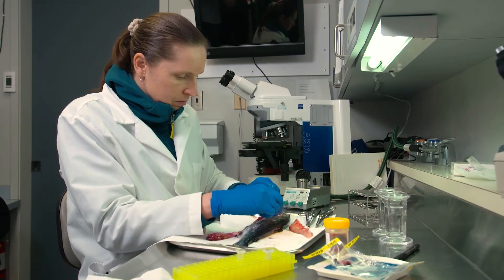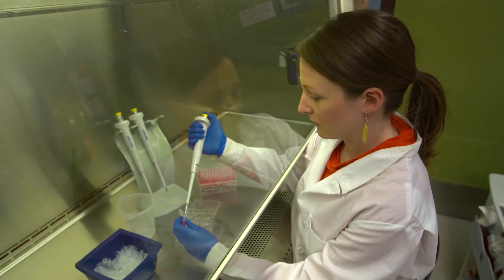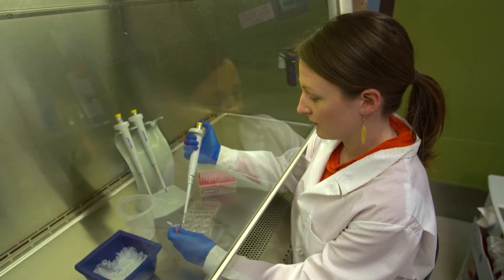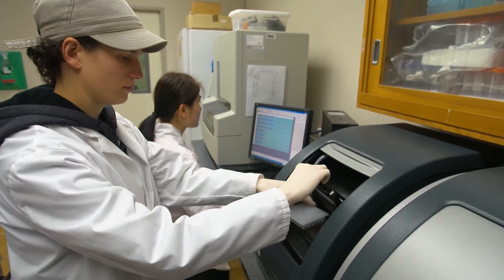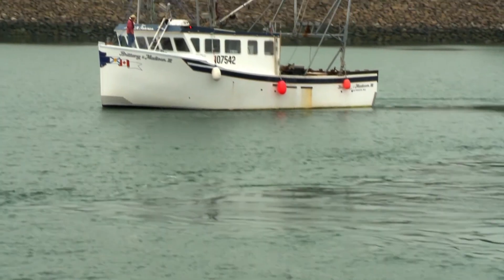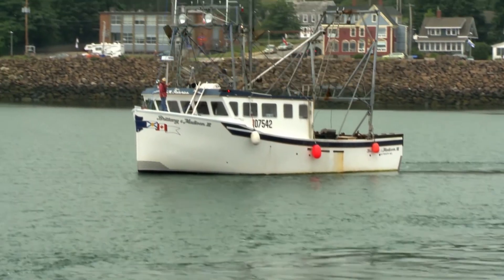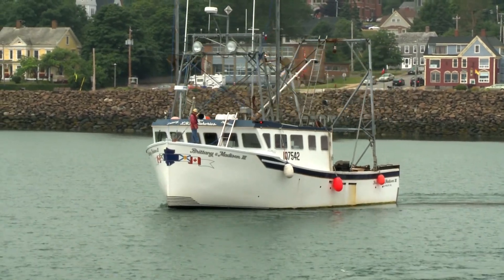Every step of this process in the lab involves highly trained individuals. The science advice that comes from their work provides the evidence needed for managers and regulators to make informed decisions that directly impact Canada's aquatic resources — resources that Canadians depend on for healthy aquatic ecosystems and sustainable fisheries.